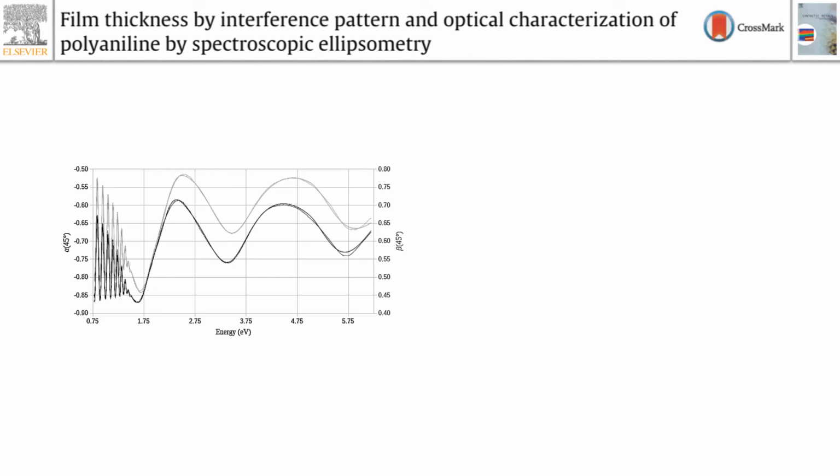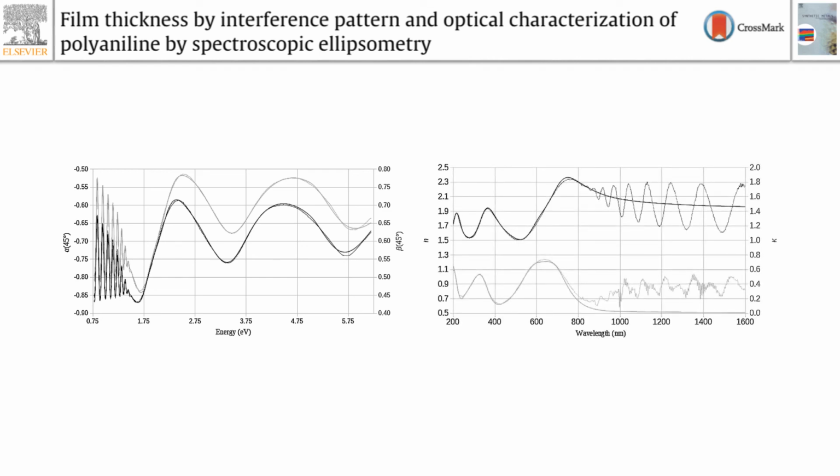In general, Tauc-Lorentz model is indicated to fit data from amorphous materials. The plot at the right side of this slide shows the comparison between the direct inversion of parameters and the optical properties calculated from the fitted model. It shows to be in agreement in the range where the sample is opaque, which suggests that the designed model here is reliable.